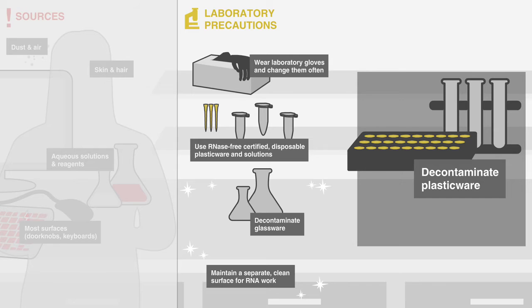Decontaminate polycarbonate or polystyrene materials, such as electrophoresis tanks, by soaking in 3% hydrogen peroxide for 10 minutes. Remove peroxide by extensively rinsing with RNase-free water prior to use.